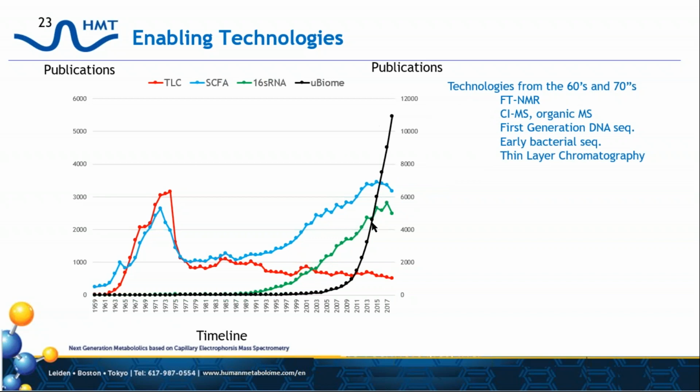Today, microbiome work is skyrocketing due to the advent of RNA sequencing, public sequencing databases, as well as metabolite databases. These, in conjunction with CE-MS, are now becoming enabling technologies to measure and associate a specific microbiome with the classification provided by the RNA sequencing.